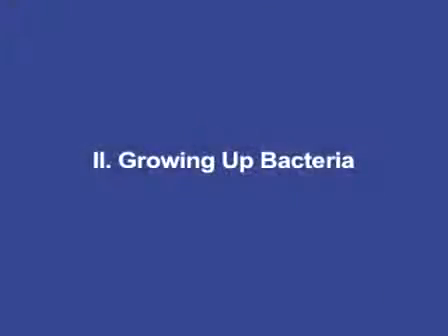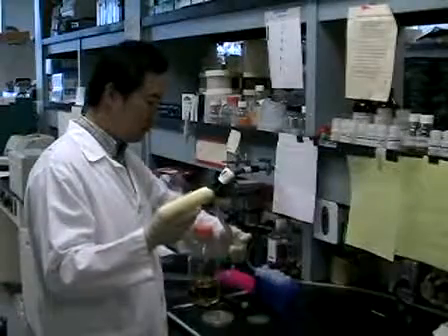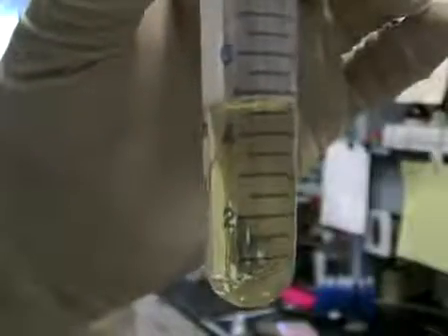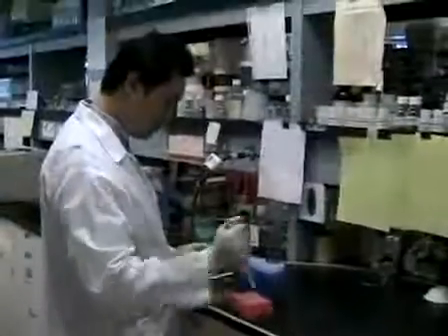Before we do the mini-preparation, I'll briefly introduce what we did yesterday. In order to grow bacteria, I need to first inoculate 5 ml LB into individual tubes. As you can see, before we put bacteria into the tube, the media is clear. I'll use pipette tips to inoculate a single colony from an LB plate, and I'll switch tips every time so there's no contamination. Then I'll put the tubes in a shaker using 300 RPM to grow for at least 8 hours, and normally we can do it overnight.